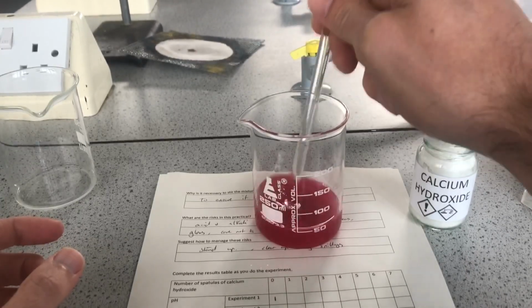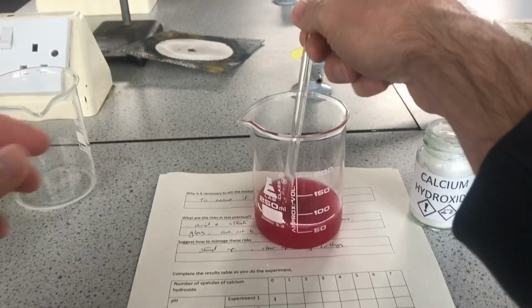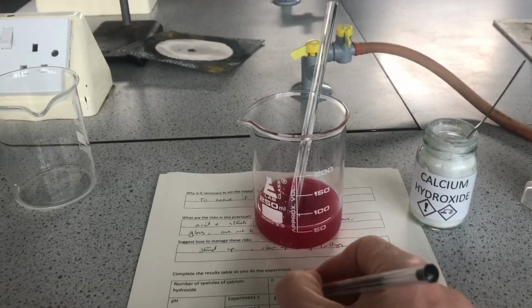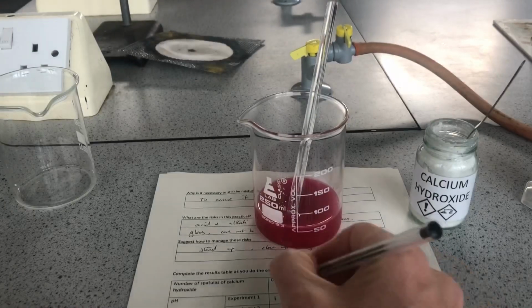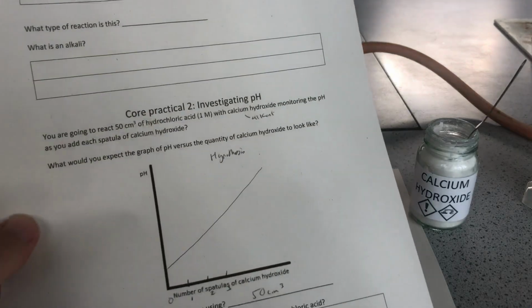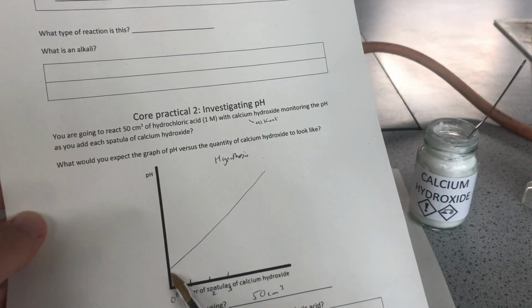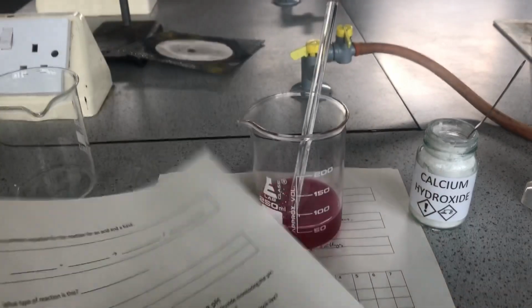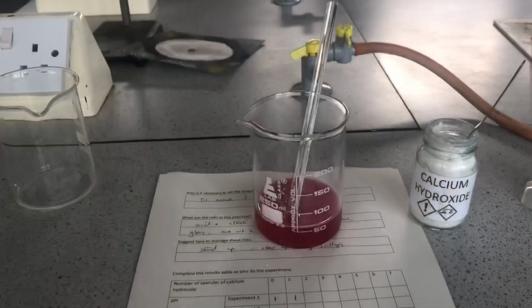Now, I don't think there's any change in colour in the universal indicator. So pH is still 1, which is a bit different to the prediction. People were expecting the pH to rise, and it's not. It's carried on flat. Let's do a second one.